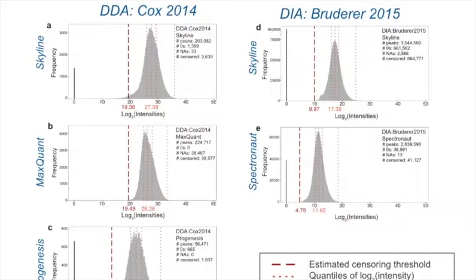Okay, so this is actually what we do next. Remember we have two steps, right? First we take care of the yellow part, which is the technology. We summarize, and then we take care of the pink part, which is the biology. So for the technology part, the first thing we need to do is to work with those NAs, which we assume are censored.